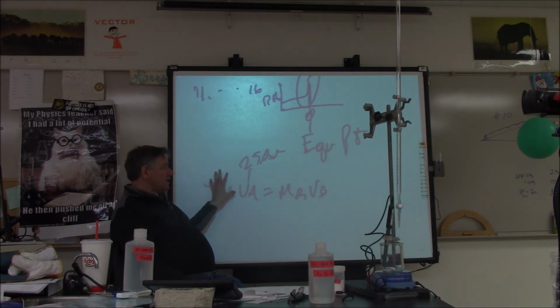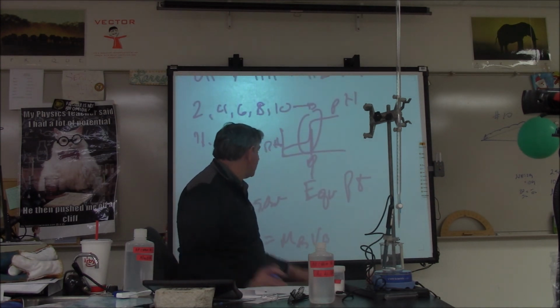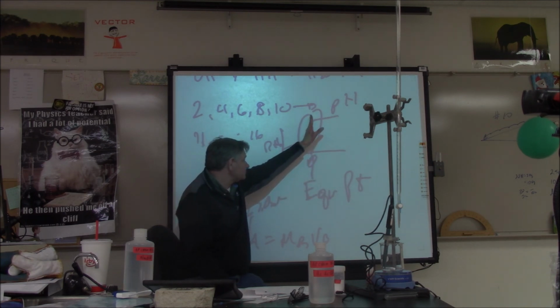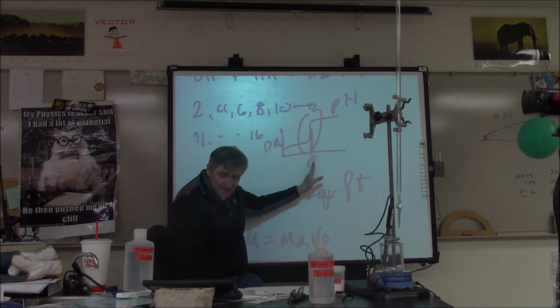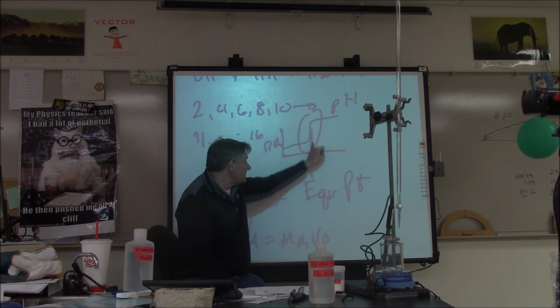The reason I'm pointing this out is so that you see the importance, when you generate this pH curve, of having this data just right. You have to have a whole bunch of data sets in here so you can find the exact midpoint.